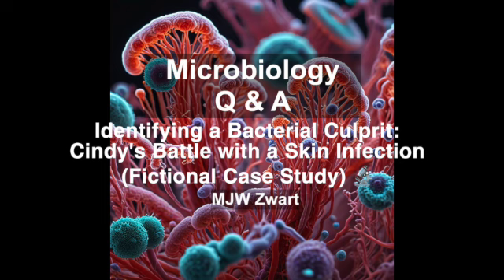So now we know these bacteria are spherical? They cluster together and they're gram-positive. Those are some valuable clues. Are we ready to unmask the culprit? Almost. By combining these visual clues with other tests and their knowledge about common bacterial suspects, we can finally solve this medical mystery. Deep divers, we're back.